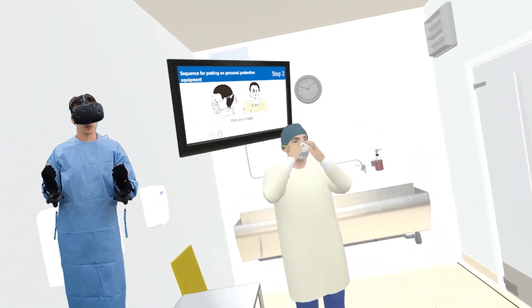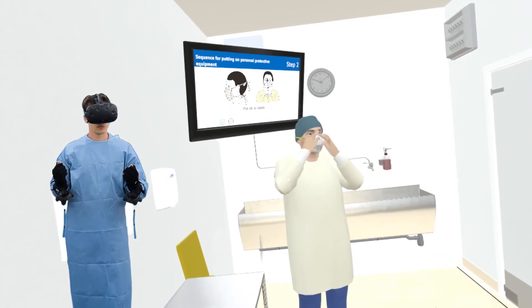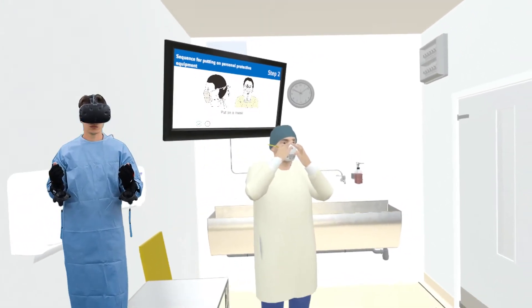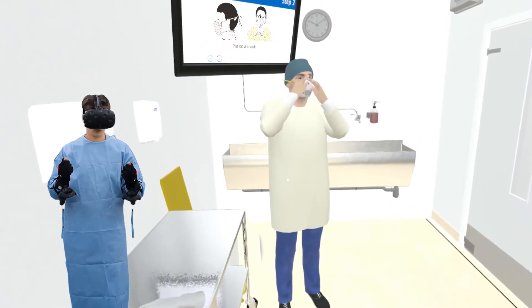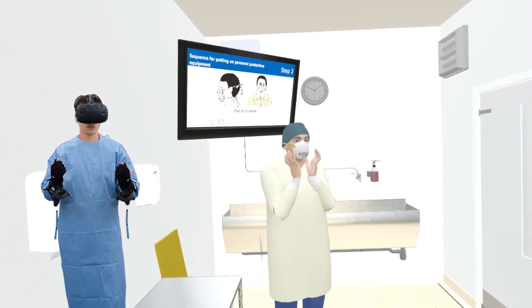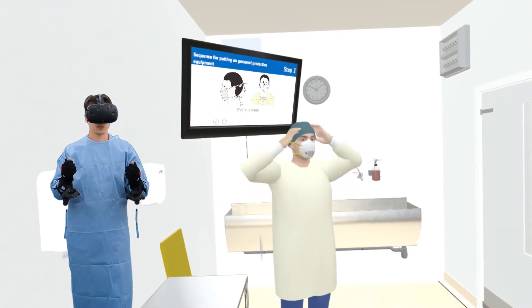Mold the metal nose strip to conform to the shape of your nose. Do this by placing both your middle fingers at the bridge of your nose and use your index finger to press along the edge of the mask, along the sides of your nose into the cheeks, creating a good seal. Repeat pressing with index fingers with pressure, especially along the side of the nose. Perform a seal check by placing your hands at the side of your face at eyebrow level without touching the mask.